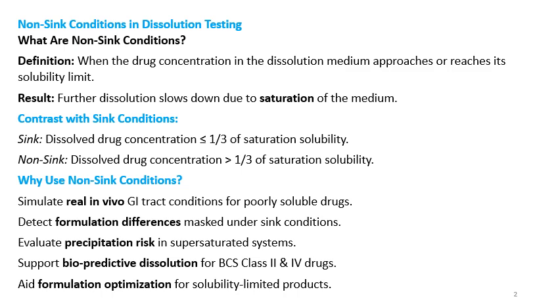So if you require that the dissolution should show exact formulation variables and it is not limited by the solubility, then sink conditions are required. And that is the reason the sink conditions are recommended. But sink conditions are not mandatory. You can justify the non-sink condition also, but you should demonstrate that you are not able to meet the sink conditions.